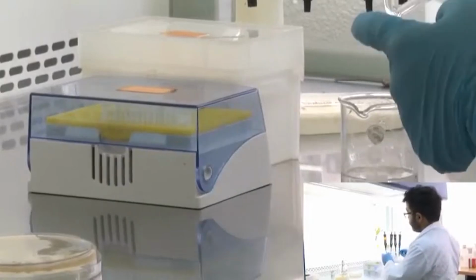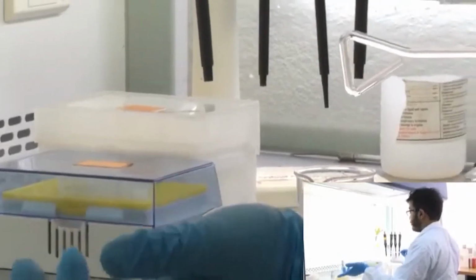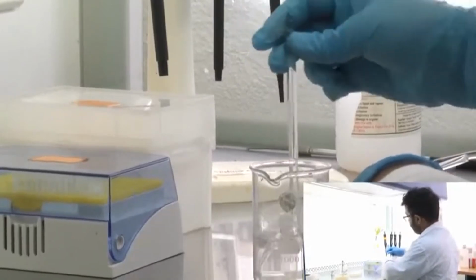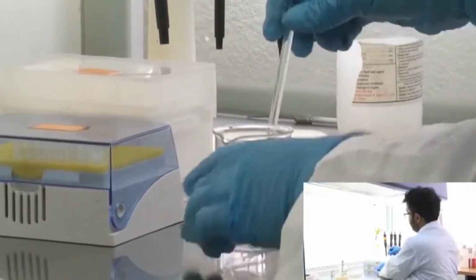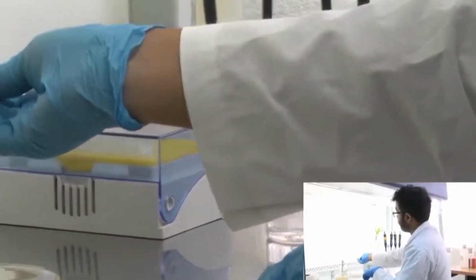You need to make sure that this surface does not contain any bacteria other than the bacteria you have been using for the transformation. For that purpose, you have to sterilize it in 70% ethanol. So that's what I am doing. I am making sure that the entire surface is dipped in 70% ethanol, and after that I am holding it to the flame.